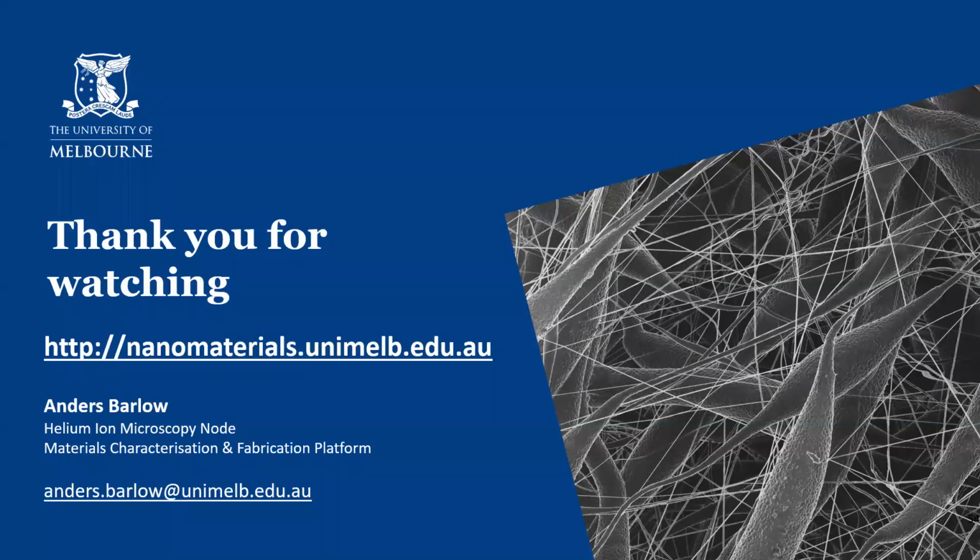If you imagine that we had an absolutely perfect graphene layer with nothing beneath it, then we're not going to see the graphene structure or something like that. We would just see kind of a gray image. So there needs to be something beneath it or on top of it to tell us that that's what we are actually seeing. Typically, of course, for single layer graphene, you're going to have that suspended across something of an aperture, like a TEM grid, and we can see the grids beneath the graphene, which is an interesting effect because what we're actually doing there is the helium ion is penetrating through and is generating secondary electrons from both the top and the bottom surface of the graphene.